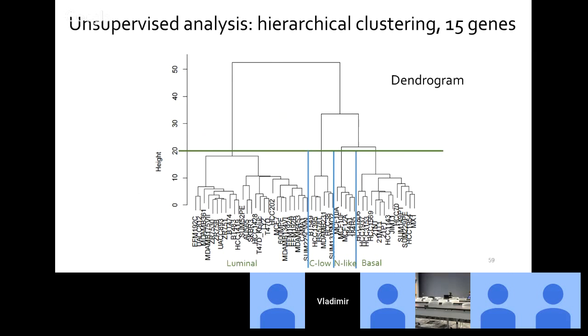So for these new groups, for these new clusters, we repeat the analysis, we repeat the selection of potentially most informative genes, we then go back to clustering, and using these iterations, we potentially get a better and better idea of clusters we have in our data.